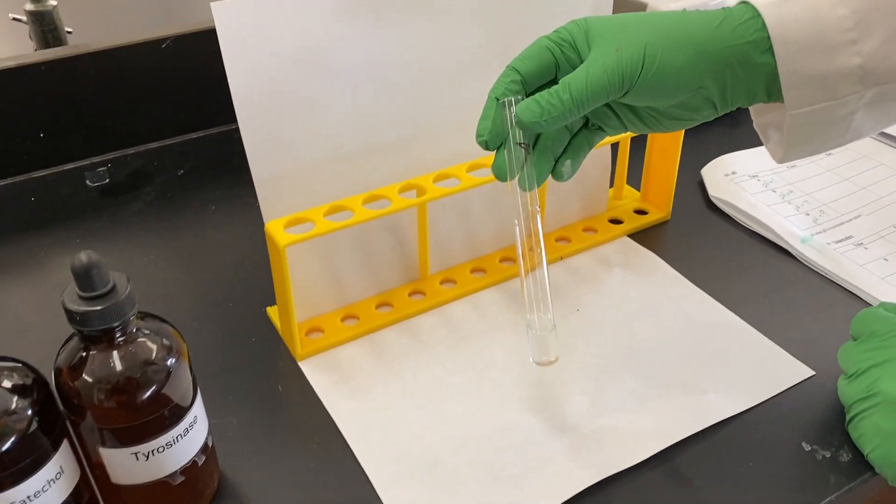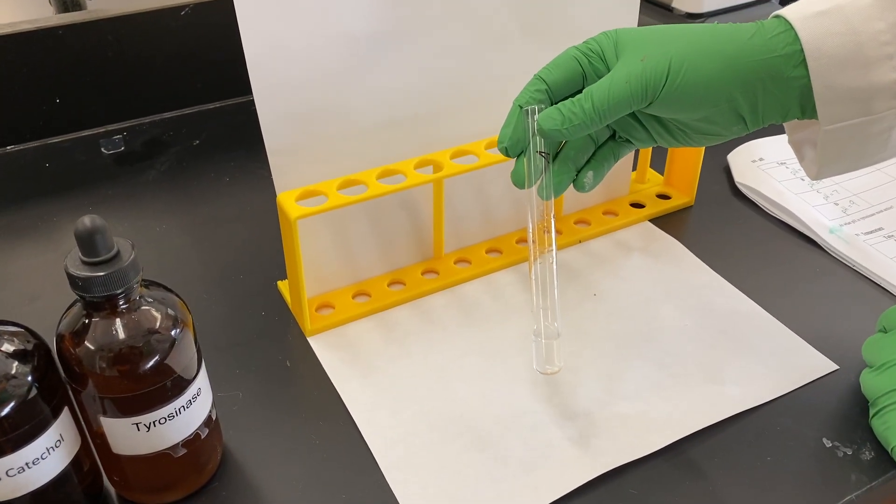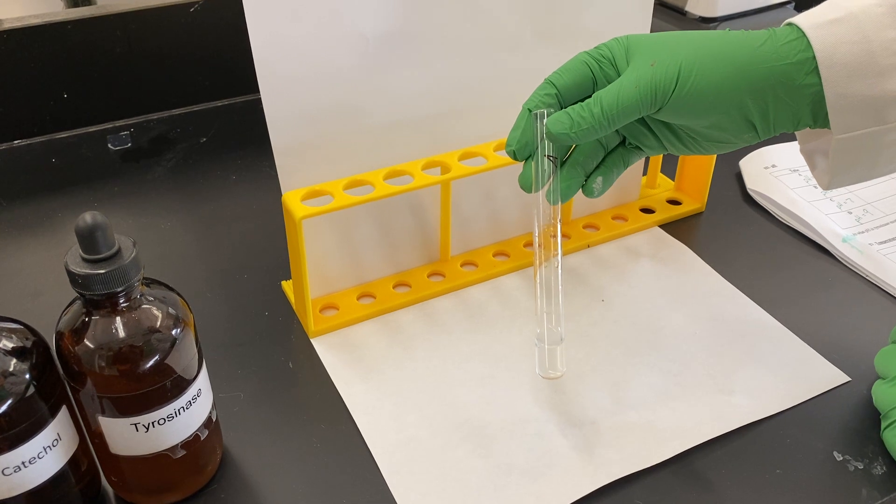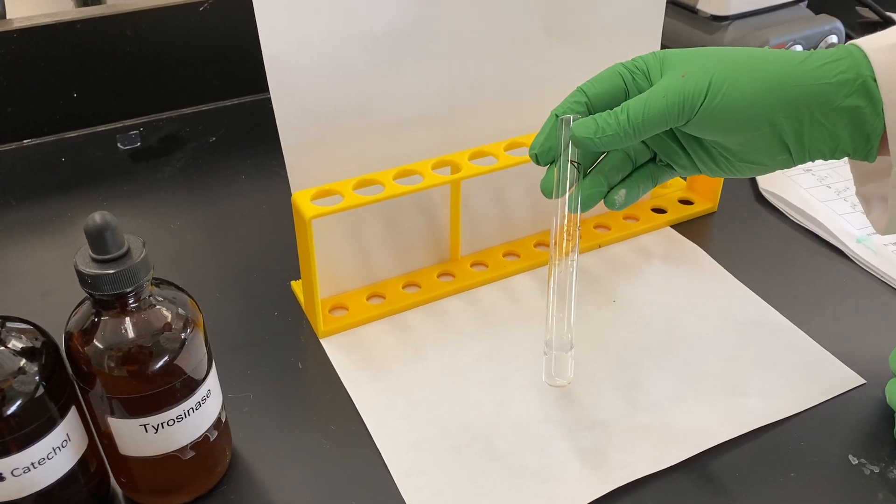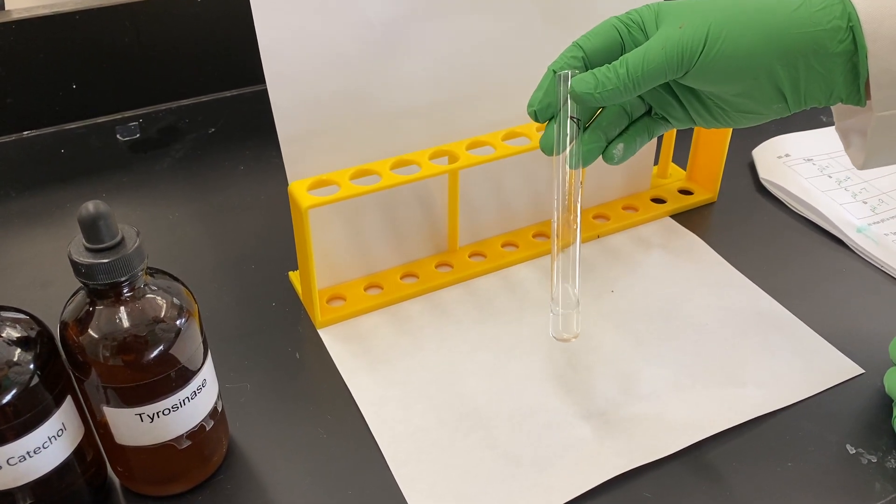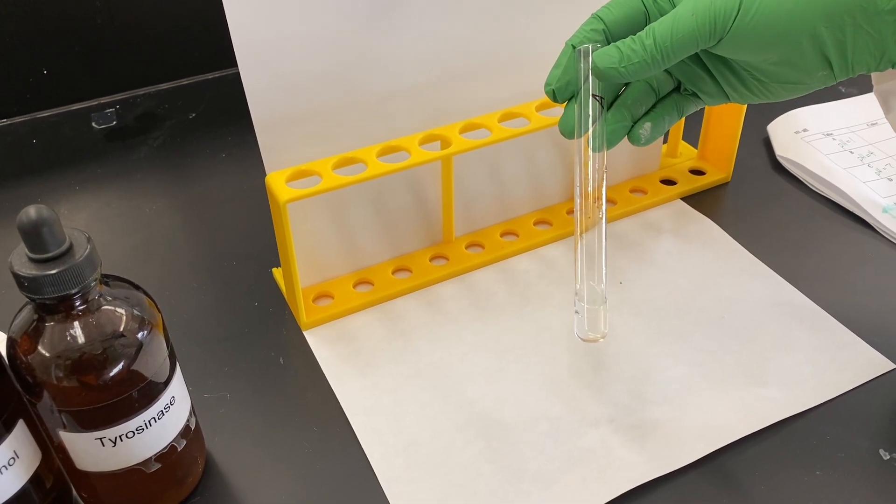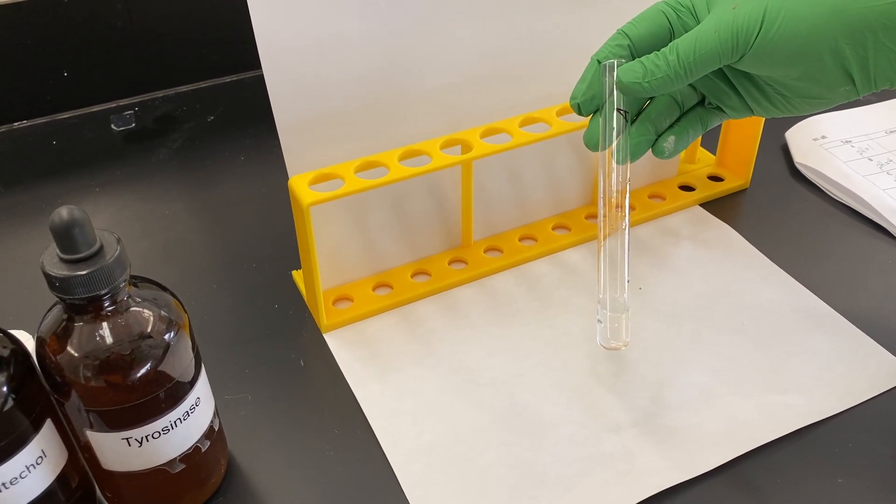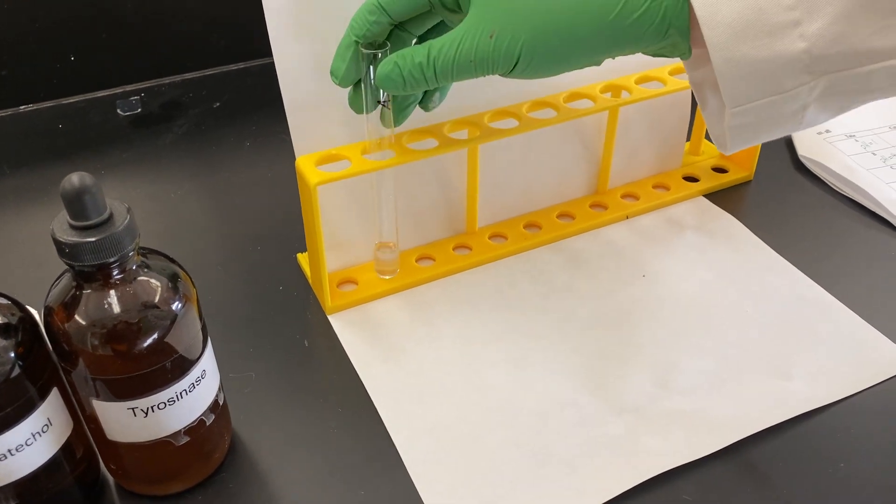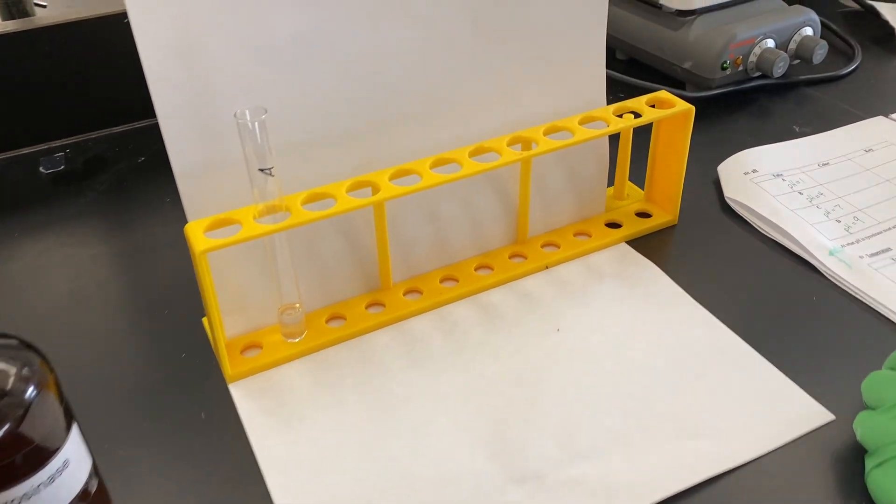This is test tube A. We of course have our catechol and our tyrosinase. We also have hydrochloric acid. This is at pH 1. I'm seeing no change. It looks clear to me. pH 1. Make sure to record this on your data sheet. Pause the video if you need. I'll see you in a second.